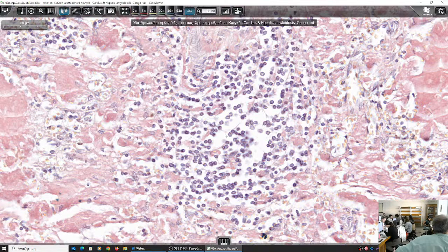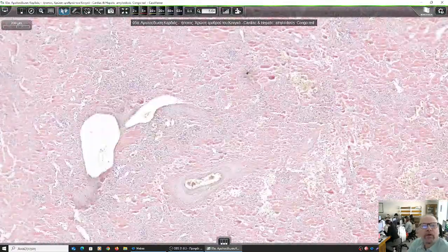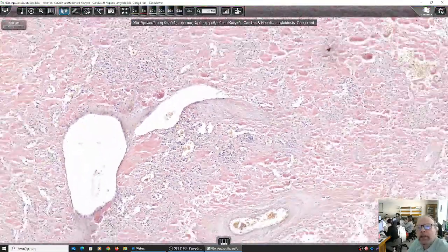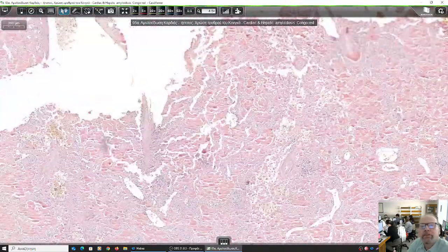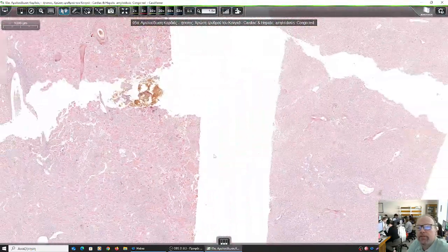However, amyloidosis is not connected with inflammatory infiltrate. It does not cause inflammation in the tissue where amyloid is deposited. But I see them here, that's why I ask. So can I tell which tissue this is? Probably the liver, but where are the liver cells? With the trabeculae, I'm not sure. It is filled with amyloid.